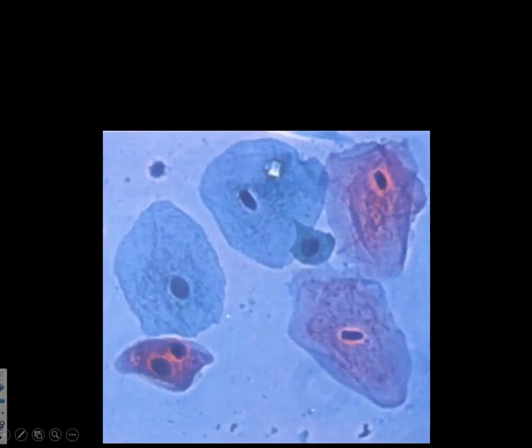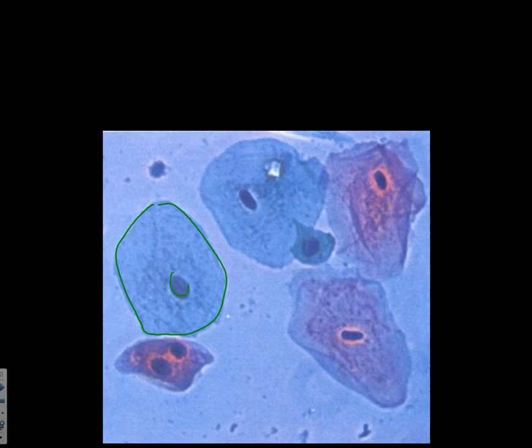So here is another example of tissues. And just taking a look at this here, I am not seeing multiple layers. All right, the cells are really wide. Here's the outline of the cell. Really wide with a bit of a nucleus. I'm seeing them from one side. So to me, these look like squamous cells or flat cells.